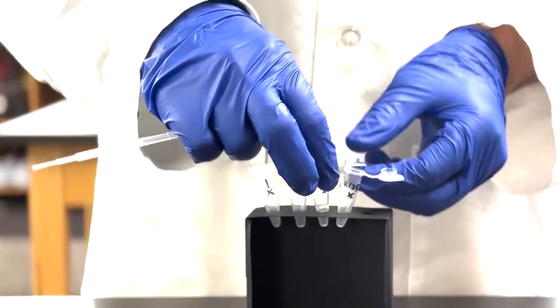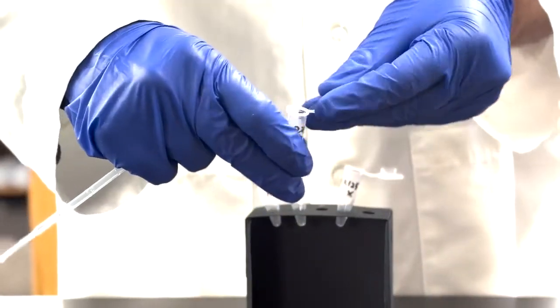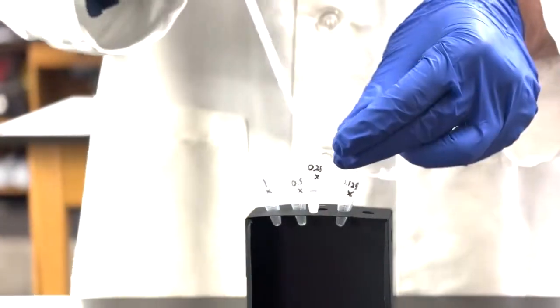Serial dilutions are commonly employed in various scientific fields including biology, chemistry, and microbiology. They serve several important purposes.